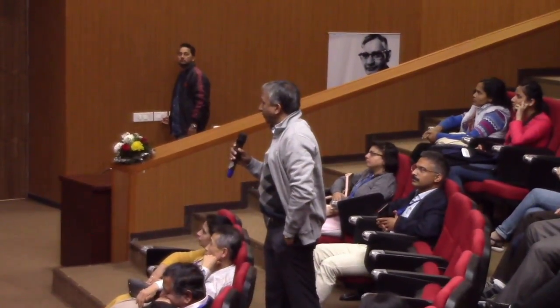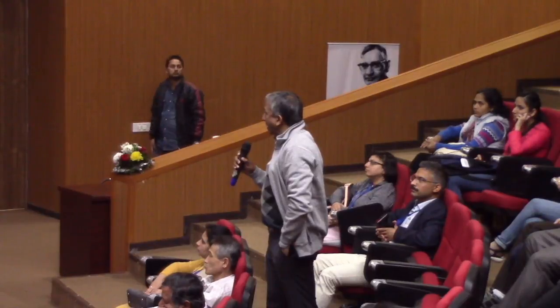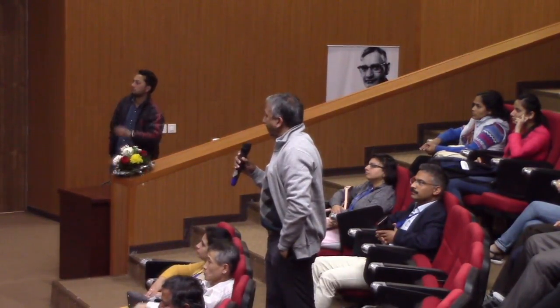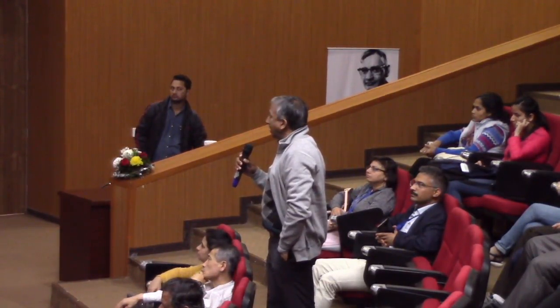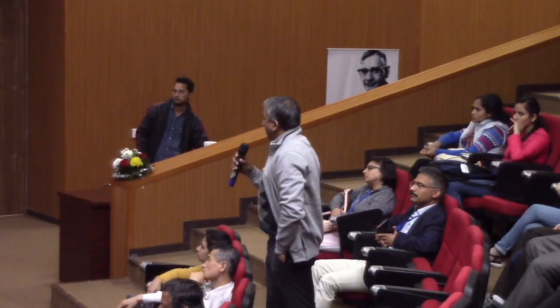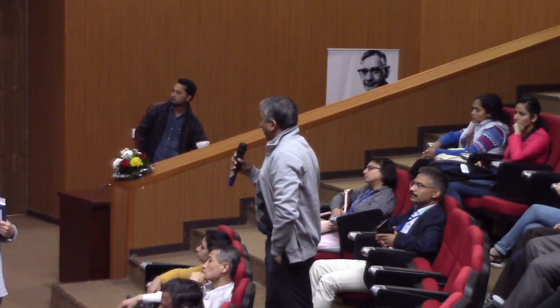Dr. Subramaniam, I have a few queries. You showed resolutions from 3.8 to 1.8, which is amazing. My queries are, first, what was the number of particles you picked up for the class averages in each case with increasing resolution? The second was, what was the sigma contour of your electron density maps? And as far as the ligand is concerned, what was the occupancy of the ligand, and you contoured the ligand density at what sigma?